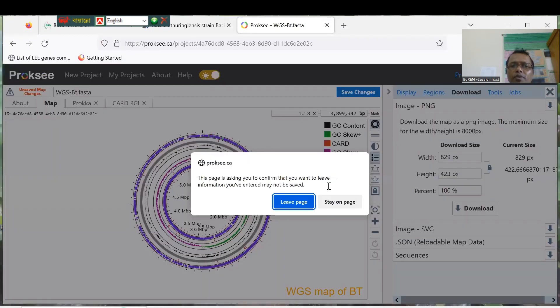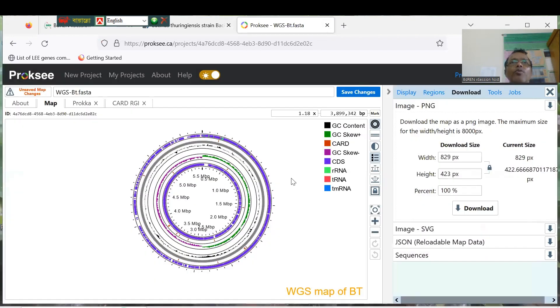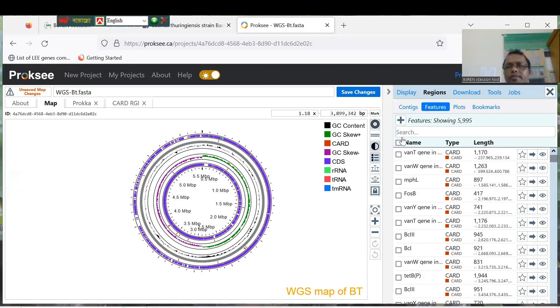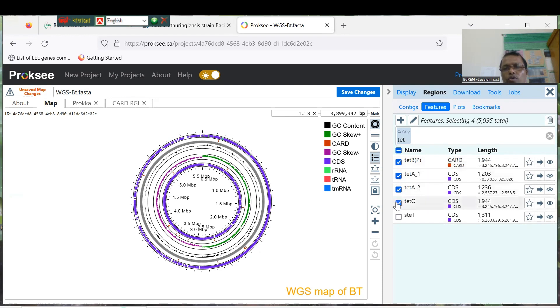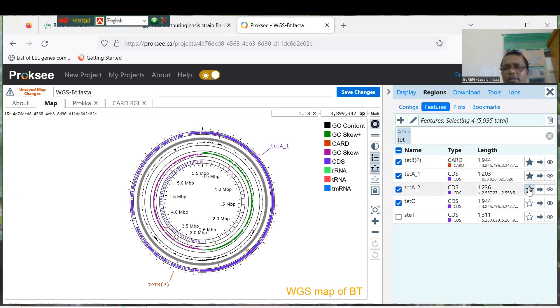If you want to modify the map and add specific genes — for example, tetracycline resistance genes — you can search and see tetracycline A, tetracycline A, and tetracycline O. Click Favorite for each one. You can show four tetracycline resistance genes in your map this way.